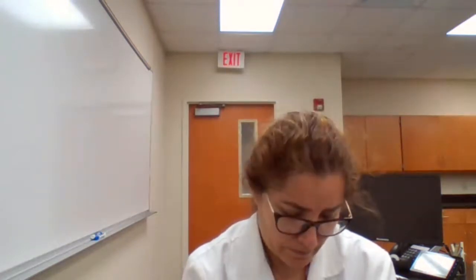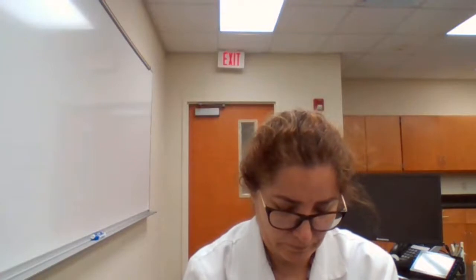And the second week is the classification test to confirm the functional group. And after you confirm the functional group, then you are going to find the actual compound based on the evidence. Any other question about today's experiment?